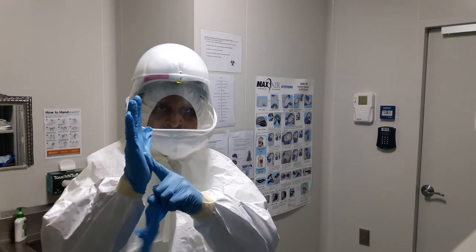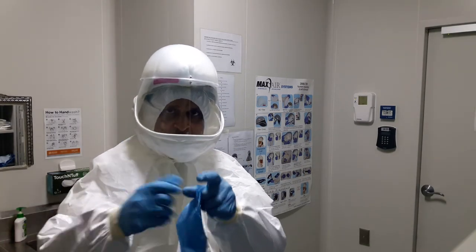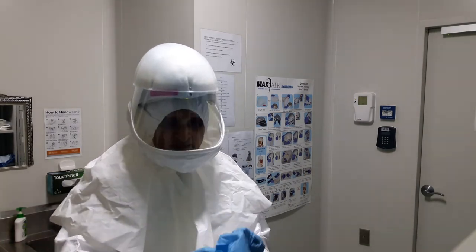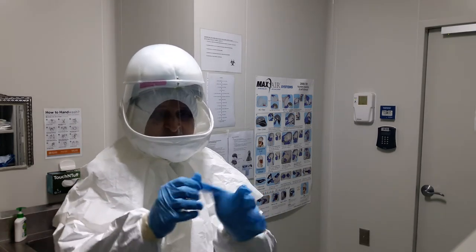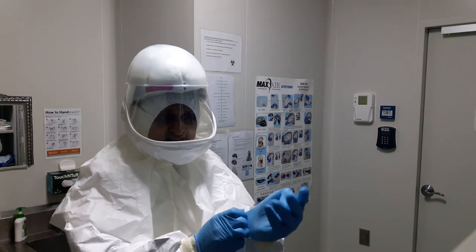Now, in the event of a spill, if I spill, I will take off my outer glove and replace it with another glove inside my laboratory space. So that is the double gloving procedure.